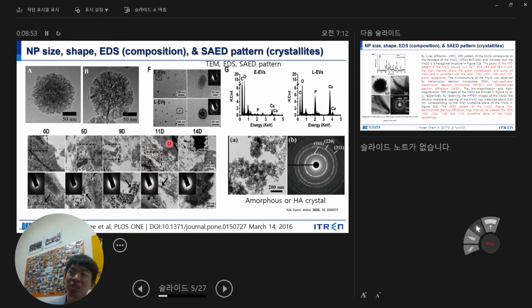So we can say that human MSC can differentiate into bone. And from the differentiation, they can make a collagen 1 extracellular matrix. And in there, they can deposit some calcium phosphate. Okay? So that is why you can see this kind of clear link here. And this is from the exosome and nanoparticle, and this is from the cells. Okay?